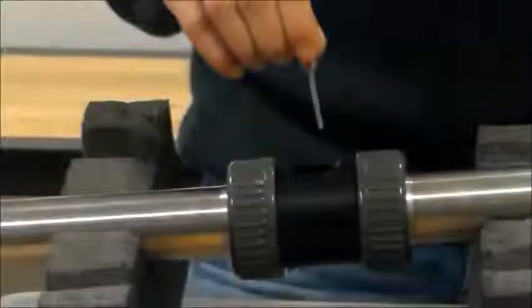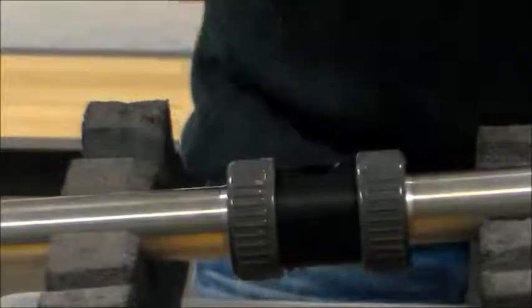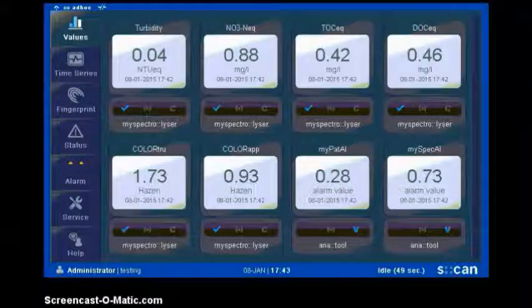The next substance we are going to test is the orange juice. As before, we rejected the event caused by the orange juice. The expectation is that this time the orange juice is not going to cause an alarm in the event detection system. As before, we classified this event with our feedback as a false alarm. That means that we do not want to see a reaction.